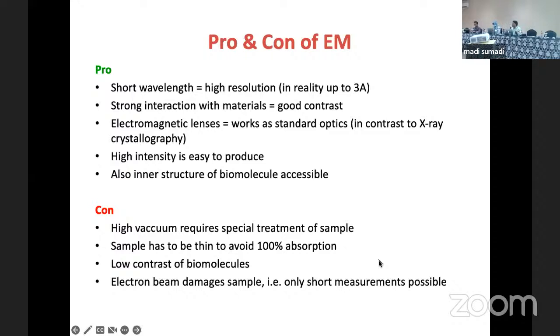There are different protocols. You need to go through all those protocols, trying to find it. So for a normal person, it's not that easy to work with. You need to have a person who is trained to understand how the system works, and then you can transform the techniques. But the second thing, as I said, this is the only one in the world so far in research where you can clearly see with your own eye and believe that it's true. And there's a reason. You can see the high impact factor papers, which are very good papers. They will always have electron microscopy because it has that weightage. People will believe and confirm. And also when you look with your own eye, you get that feeling, wow, I see a real structure inside, how it is.